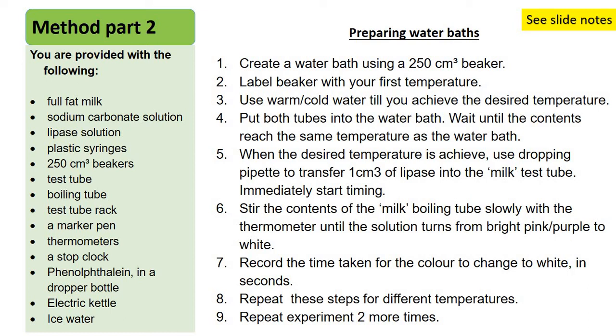Okay, now of course our milk is the white colour. The indicator, okay, is turning into a colourless solution. The overall change will be from pink purple to white.